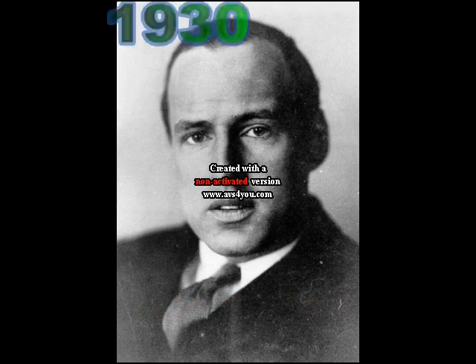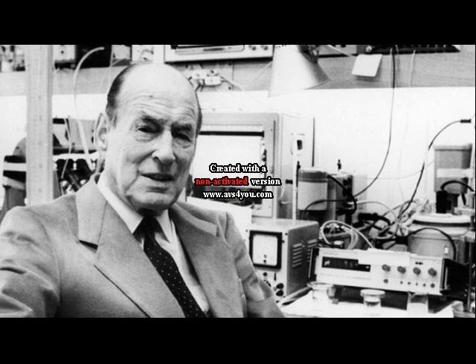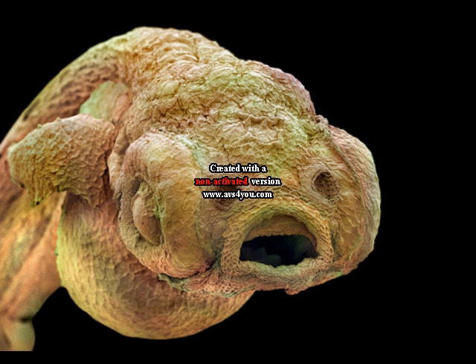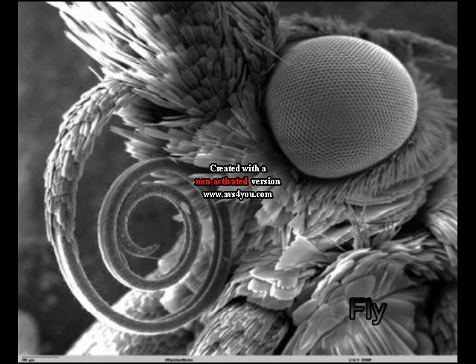In 1930, Manfred von Ardenne, a German researcher and applied physicist, invented a true microscope with high magnification by scanning a very small raster with a focused electron beam. What is special about SEM is it can enlarge organisms from a microscope and use the scanning coils to create a magnetic field, using varying voltage to manipulate the electron beam.